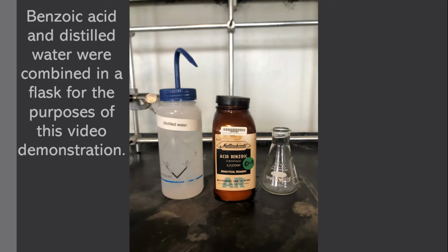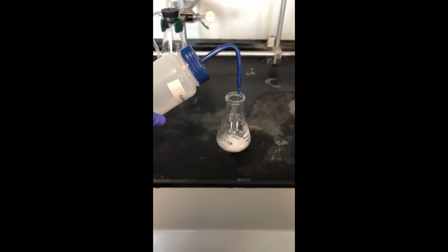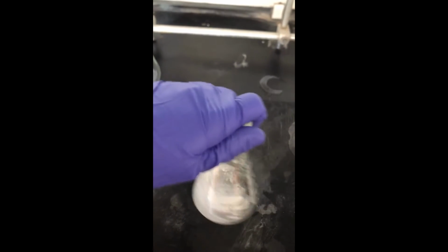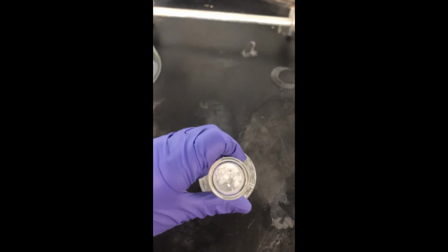For the purposes of this video, I used benzoic acid and distilled water to create a mixture with a solid and a liquid in it, but generally you'd be doing this after a preliminary reaction. And you combine these two reagents in a flask just to make that heterogeneous mixture where you can easily separate out the solid from the liquid in the vacuum flask. Here you can see me combining the water into the crystalline benzoic acid and then mixing it up to make sure that it is thoroughly distributed throughout the distilled water.